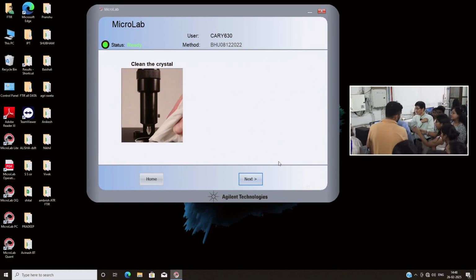In the spectra, there was a portion where it was noisy. Sir told that it was just because I0 was 0 there. Both are zero after 400, no? My question is that sir is telling that in the first case I0 was air, and in the second case also I0 will be air. So in the second case also we'll be getting that noise in that spectra. This is due to the germanium crystal.